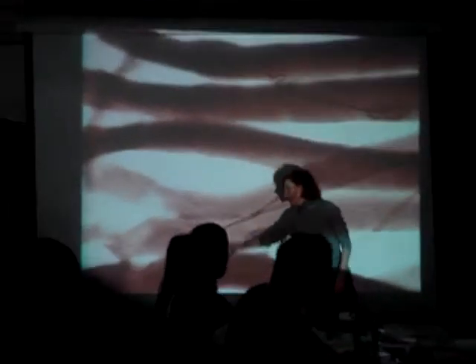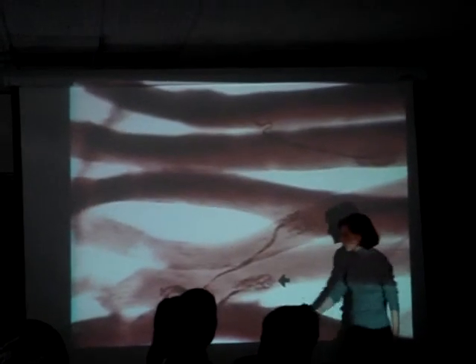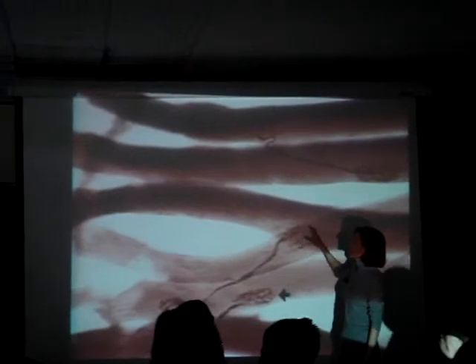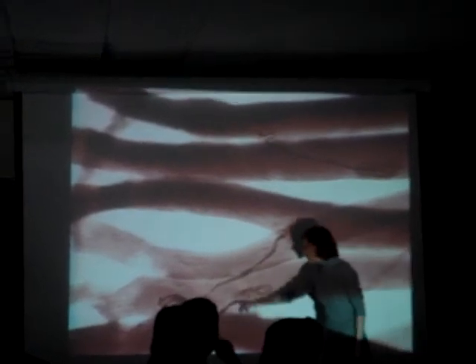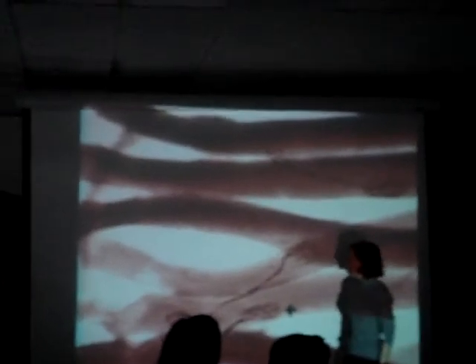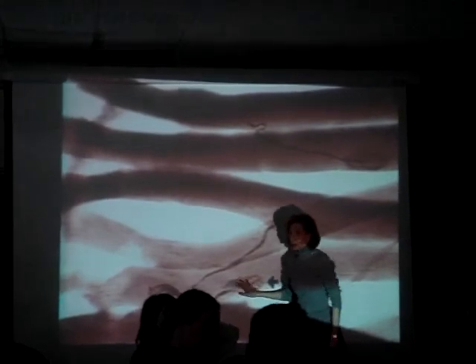Fibers. These are skeletal muscle fibers. This would be the axon. Exactly, axon. And you see branches of the axon so that there will be neuromuscular junctions on different muscle fibers. This thing here is the neuromuscular junction. Yeah, you can say synaptic knob, synaptic bulb, or you can say neuromuscular junction. Either one is fine.